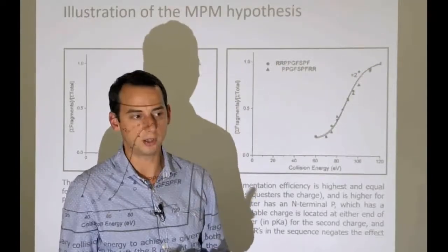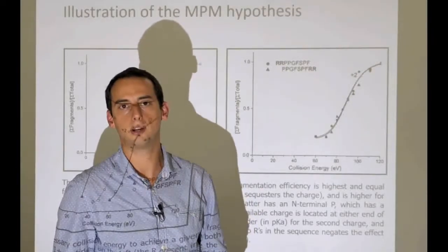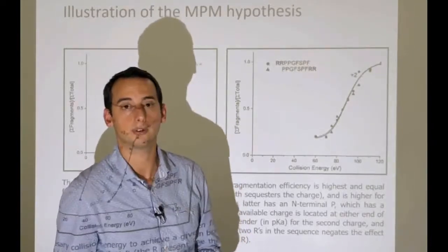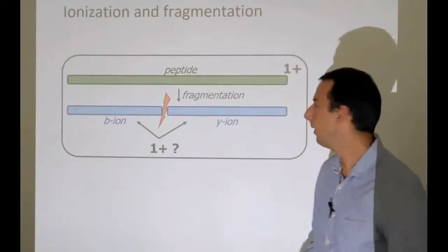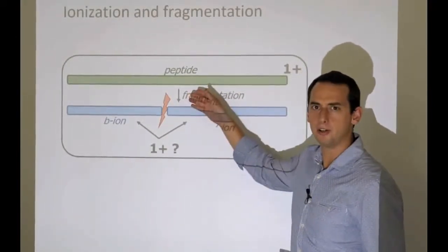This is very interesting. You get control of your data and you get to learn how the mass spectrometry actually functions on your sample. Now I'll just finish up with this last consideration. Remember that in MALDI we had singly charged peptides?